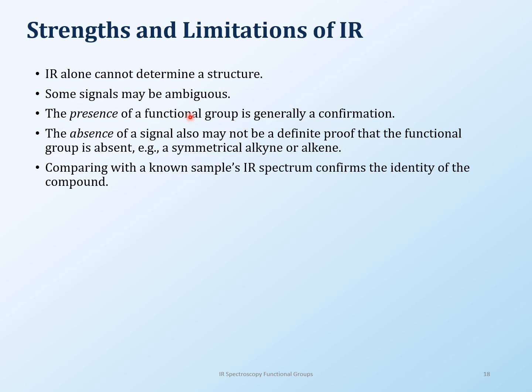Some of the signals may be ambiguous. And again, this goes with your comfort level with the IR. The more you use IR, the better you get at it, the better you understand it. The fingerprint region also. Otherwise, some of those peaks, like, should I be looking at this? Is it anything? Does it mean anything? You kind of have those questions. And that's why I want you to focus on the peaks that I've been helping you to focus on, to help you right now, just to get started.